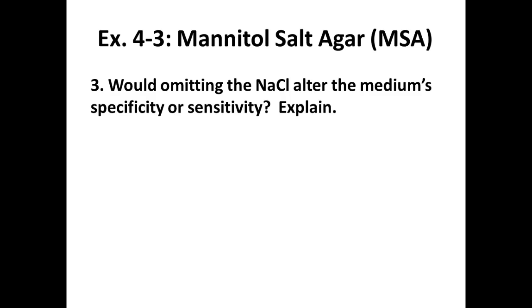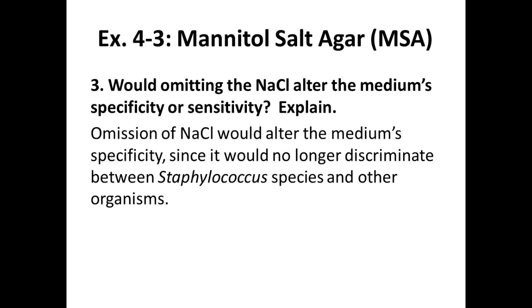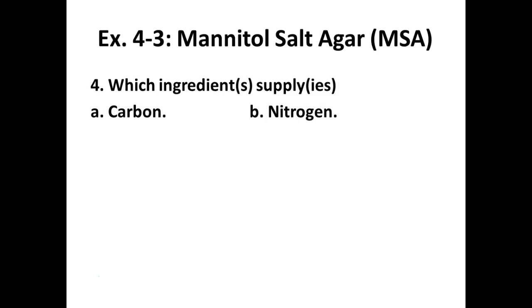Because that salt helps us be specific as to what we're selecting for. That high salt is going to help us hopefully only grow the organisms that have that high tolerance. And in clinical specimens, that's mostly going to be Staphylococci. These are the organisms that grow on your skin, right? Sometimes our skin is a very salty environment, so it makes sense.